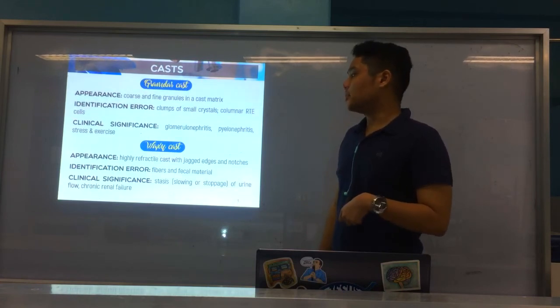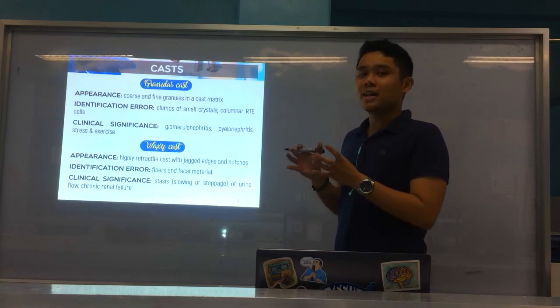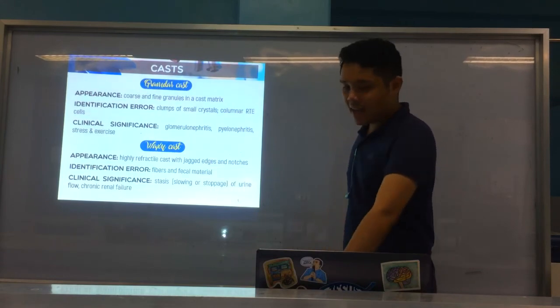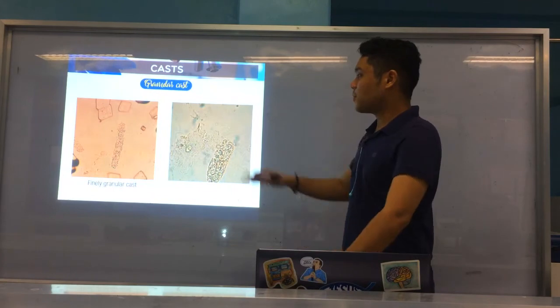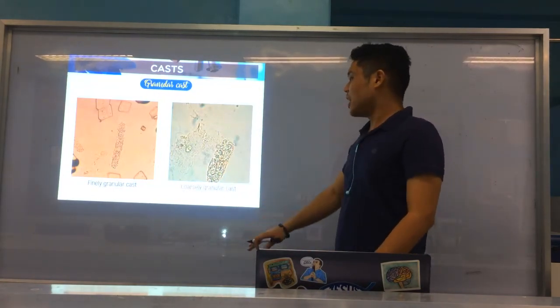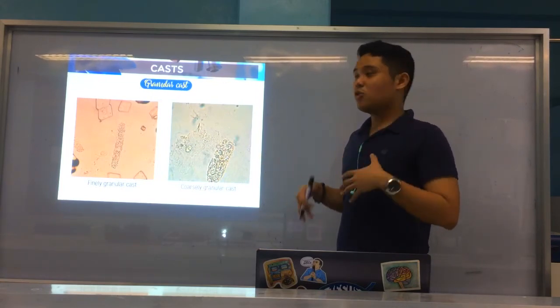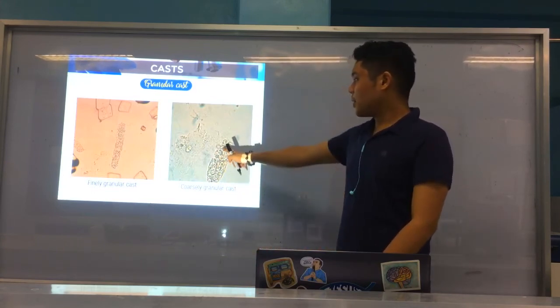So what happens is, all of these casts accumulate, alright, and they disintegrate, because not all of the cast is released. That's why waxy casts appear. Okay? Alright. And furthermore, here is a picture. So, granular cast, right, fine. And as you can see, the appearance is medyo smooth. And then coarse. As you can see, the appearance is somewhat the same, no? So you don't have to distinguish between the two. You could always just put it as granular cast. Okay? Alright. And this one with an RBC.